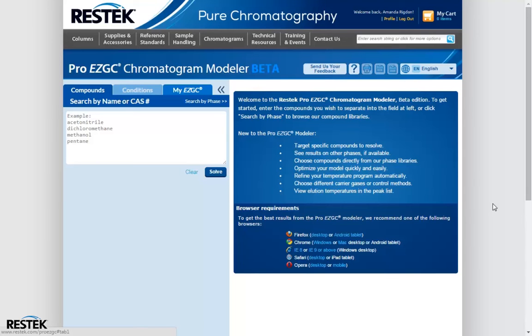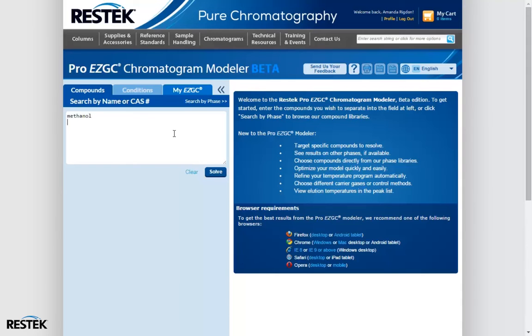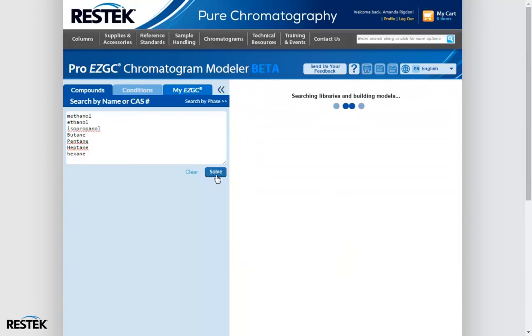Here we are at the home screen of the ProEasy GC Chromatogram Modeler. This modeler is a web-based program, and in order to use it, you will have to log into our website. In our workflow, we start with a compound list. I'm going to put in a few quick compounds here: methanol, ethanol, isopropanol. You can type your compounds if you want, or you can paste a list. After we have our compound list, we simply hit Solve.